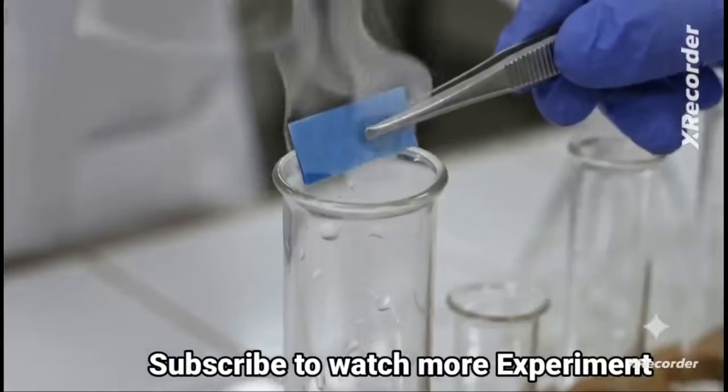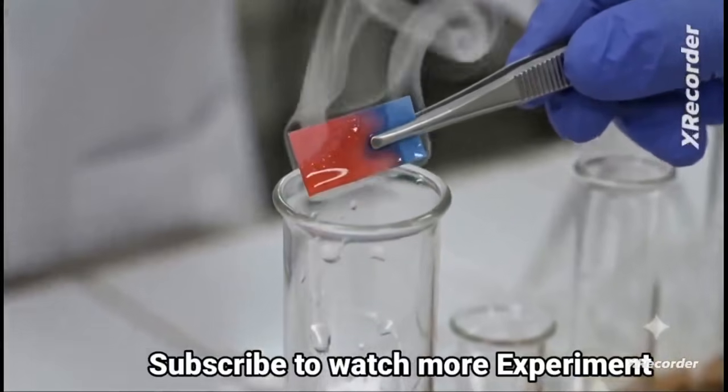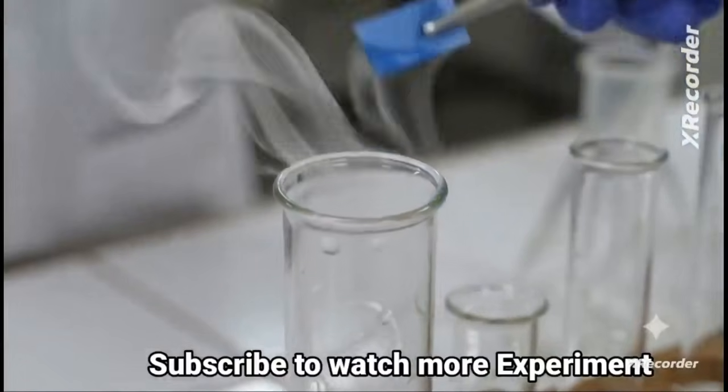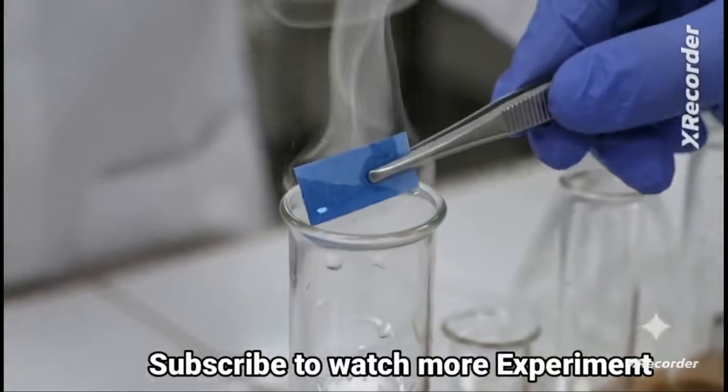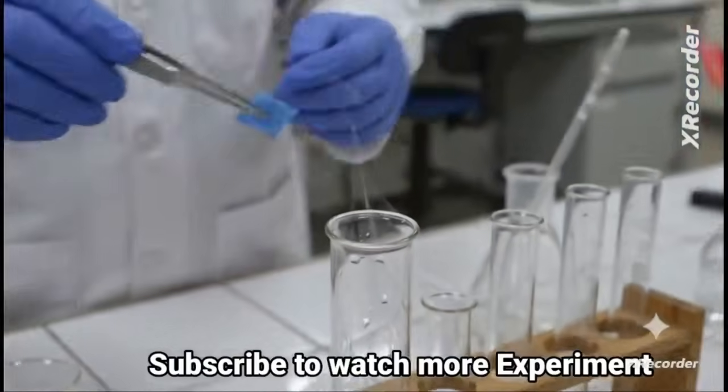Test the gas with wet blue litmus paper. Now blue litmus paper changes its color to red. The evolved gas is dry HCl gas. This experiment shows that hydrogen ions in HCl are produced in the presence of water.